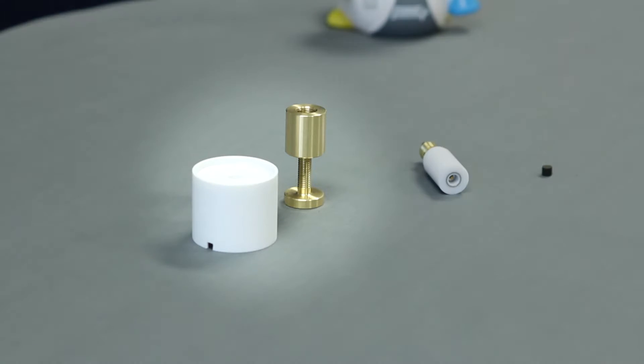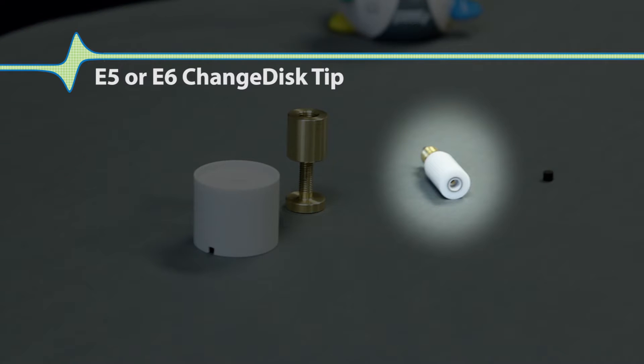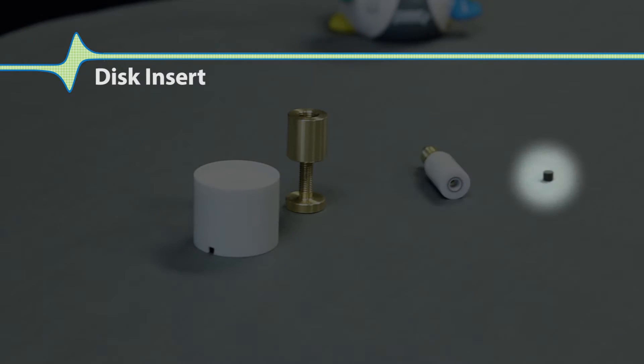First, let's go over what parts we will use in this video. The toolkit, an E5TQ or E6 series change disk tip, and a disk insert.